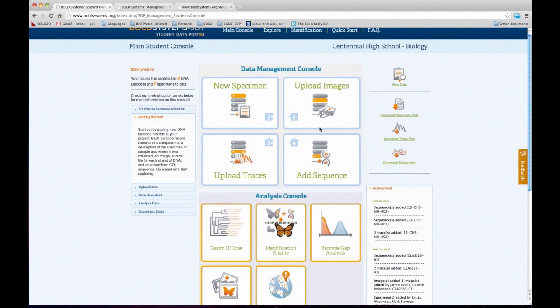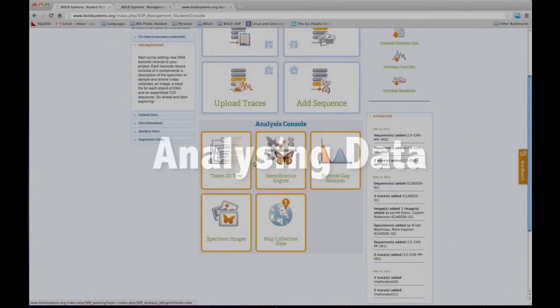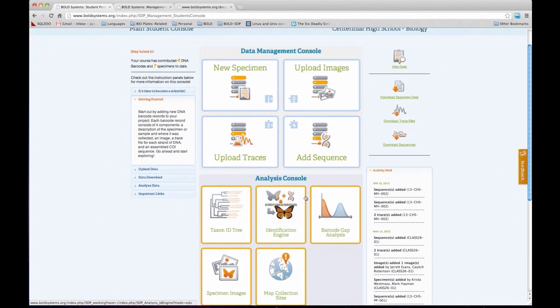Starting with the data management console — these are the uploading tools. What Bold Student Data Portal has been able to do is separate all the components of a record so that students can work on different components separately or in collaboration. You can have multiple students working on one component or multiple components. By separating these four components — specimen data, image, trace files, and sequence — anything is possible. The specimen data is mainly the collection information and taxonomic information. The analysis console has the main analysis tools used by Bold users, and they become available to students once a classroom has more than three records.